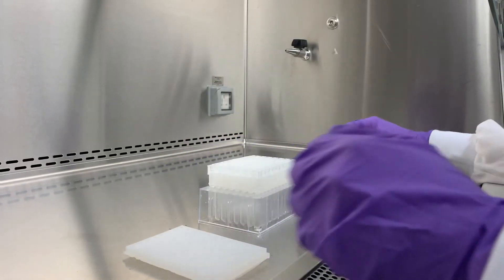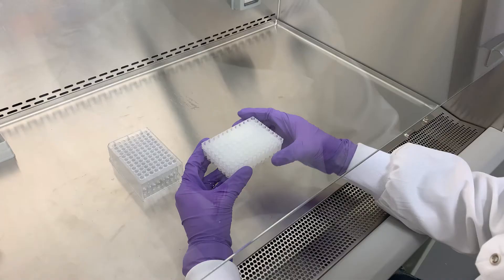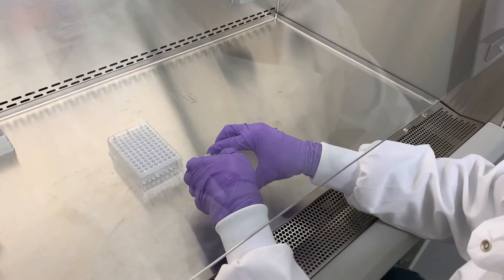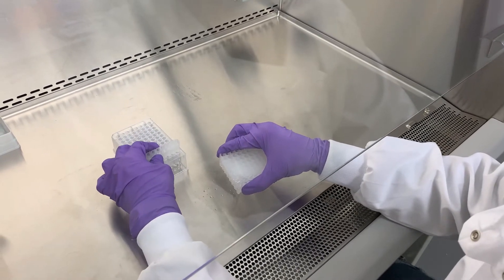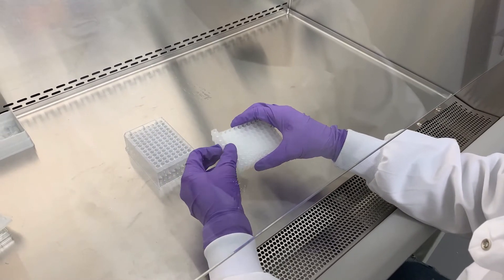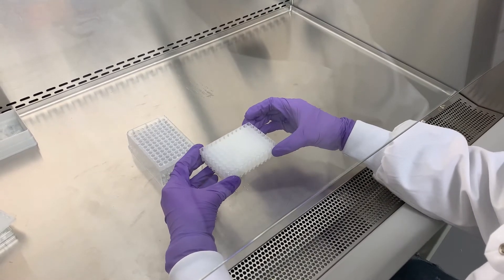If you do not need to use the full ExoSpin 96 plate, it's easy to remove and work with the individual column strips. Remove the bottom and top sealing mat from the number of strips you intend to use. Next, disconnect the strips from the ExoSpin 96 plate as shown, then replace the top and then the bottom sealing mats on the remaining columns. The unused columns should be stored at 4 degrees centigrade for later use.